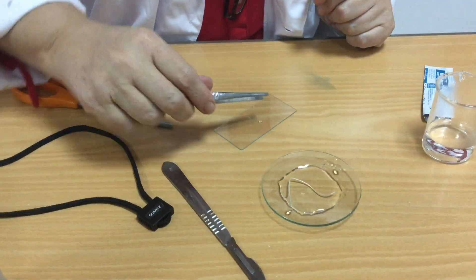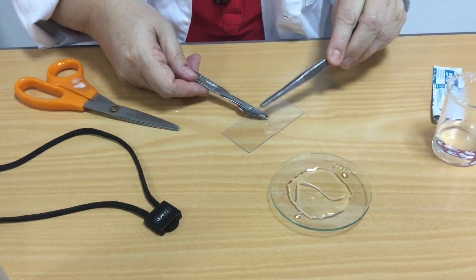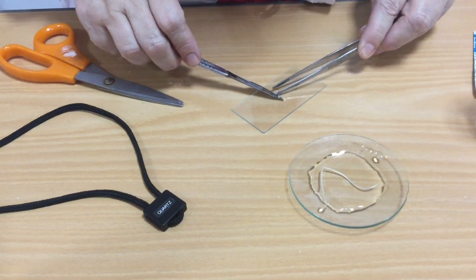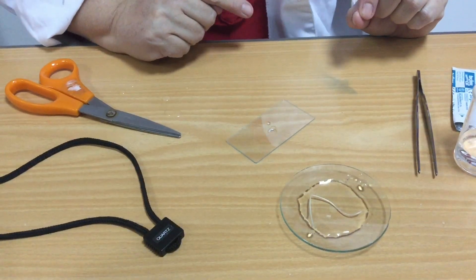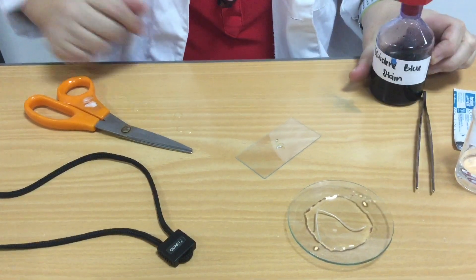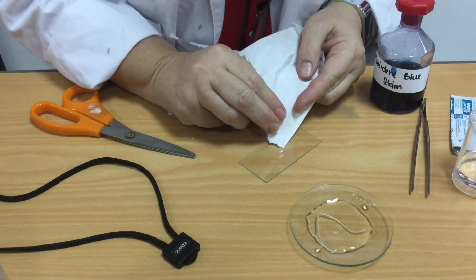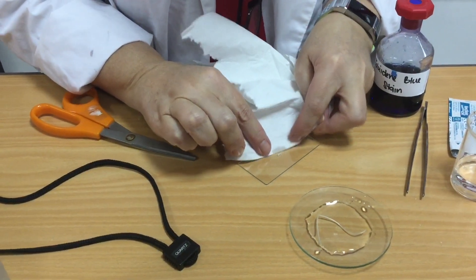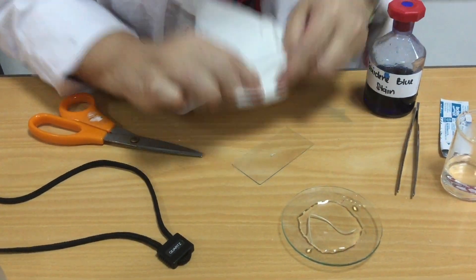I'm going to take that out using some tweezers and pop it onto my slide. It's tiny, so you need to make sure you don't lose it. There's water on there and I need to add my stain, but I really don't want to dilute my stain. So I'm going to use a little bit of tissue paper and just draw that water off. That will also immobilize my root tip so it isn't going anywhere.